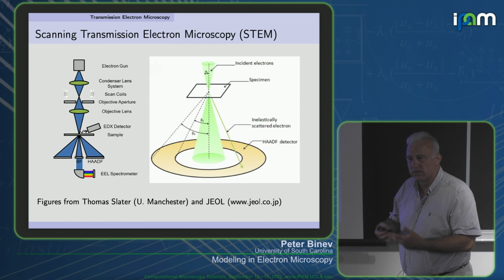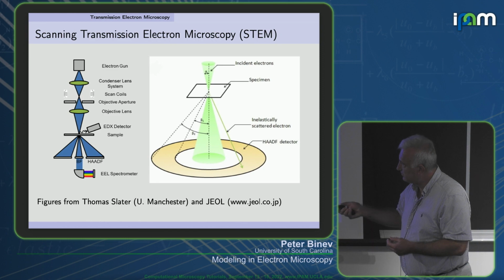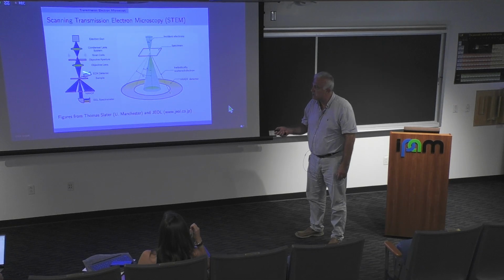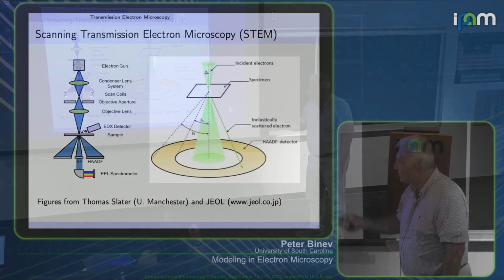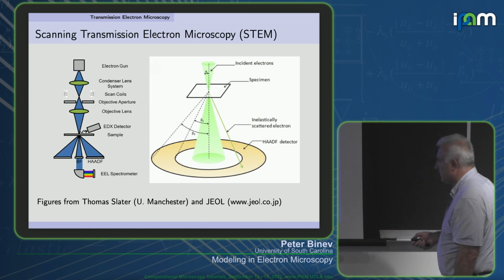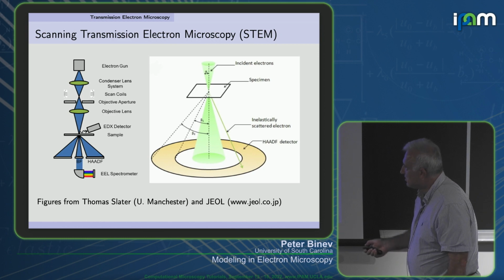on experiments, we know that when we hit the material with the electron beam, a certain number of electrons get displaced, and then we have this X-ray detection. As I said, I will not talk about this, simply to say that this model is only for this process. And then, of course, there is also the energy loss spectrometer, which is measuring what is happening below the bright field.